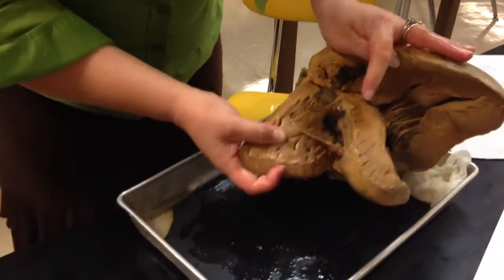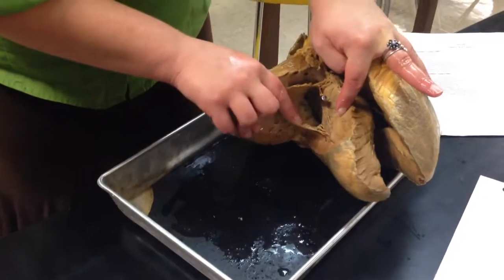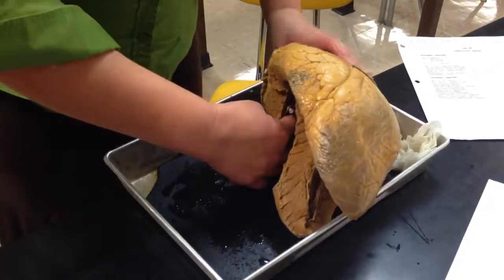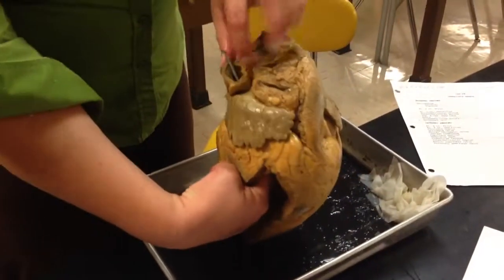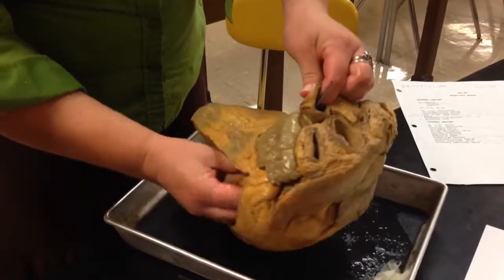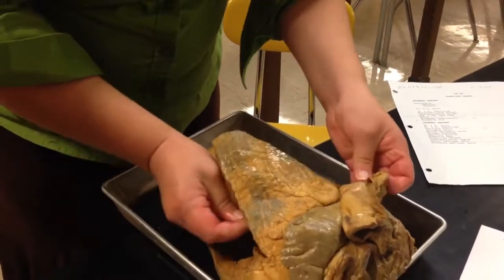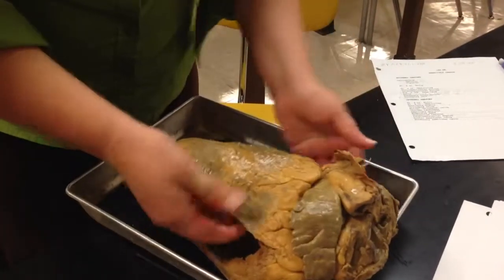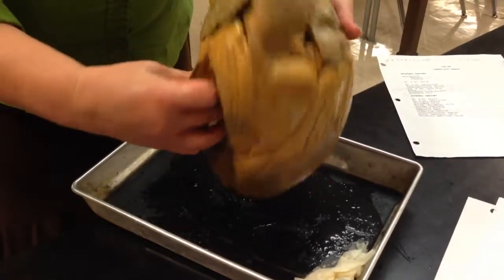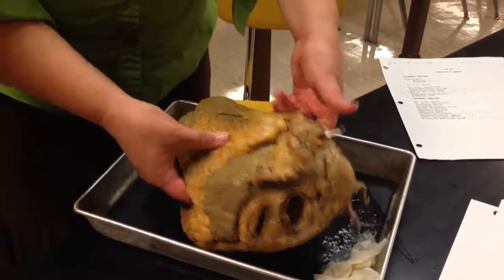So here we know that we're in right atrium because we've gone through an AV valve. This AV valve is your tricuspid because we're on the right side. So we know what chamber we're in is right atrium. If you look, this pointer comes straight up, so that would be your superior vena cava. Right atrium, superior vena cava. And then if it goes off to the side, like this one, again, we're in the right atrium. The pointer's coming out to the side, so it's inferior vena cava.